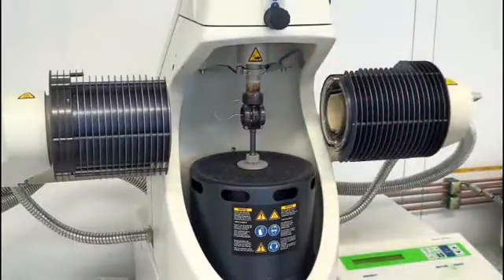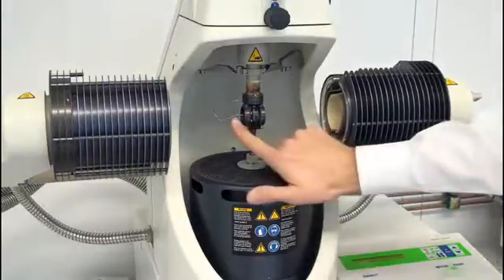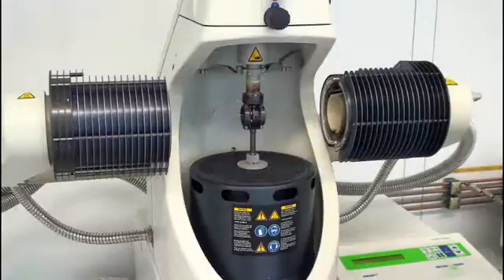This is important when it comes to calibration. And last but not least, here we have the thermocouple which measures the sample temperature. These are the key elements needed for accurate DMA measurements.